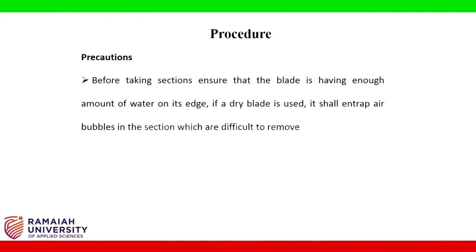Precaution. Before taking section, ensure that the blade has enough amount of water on its edge. If a dry blade is used, it will entrap air bubbles in the section, which are difficult to remove. Report. Section cutting of the given sample was performed.